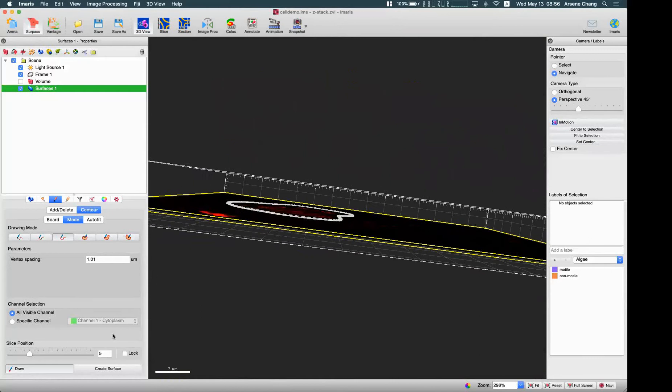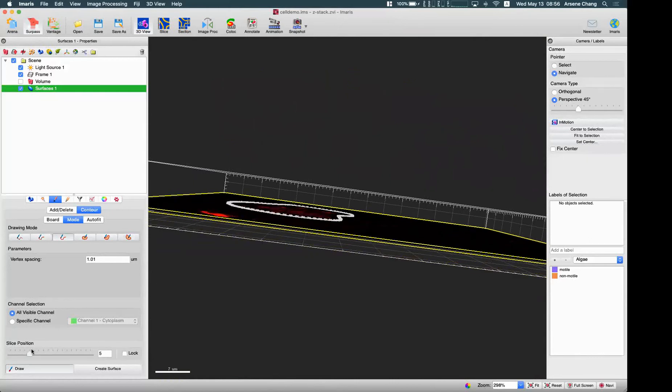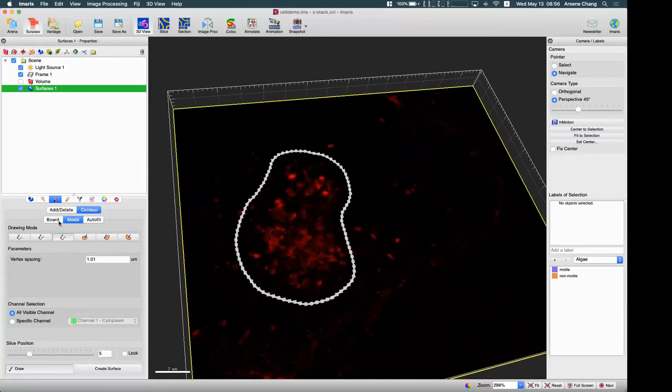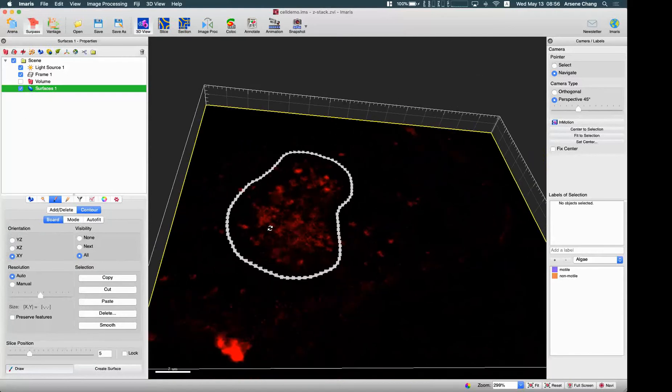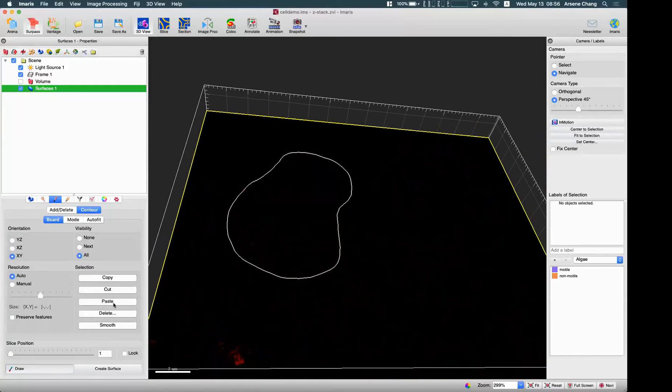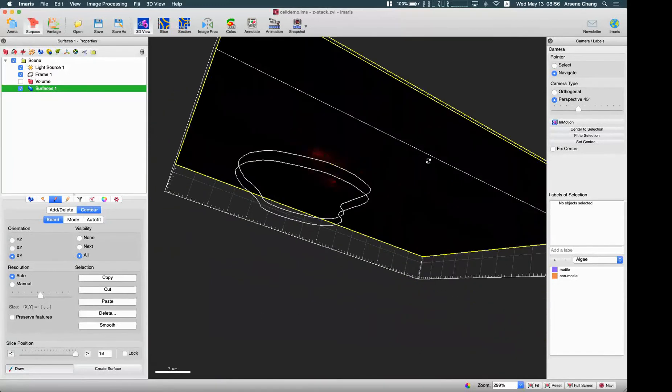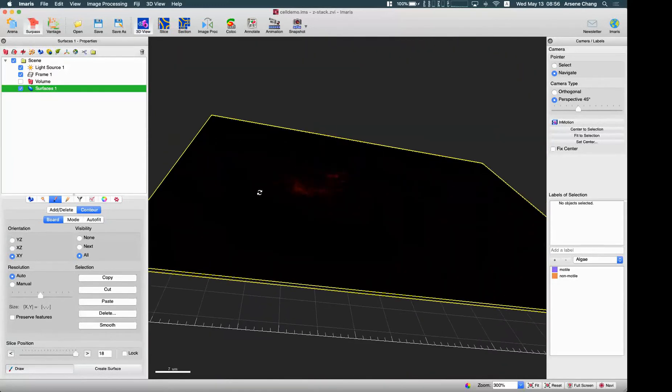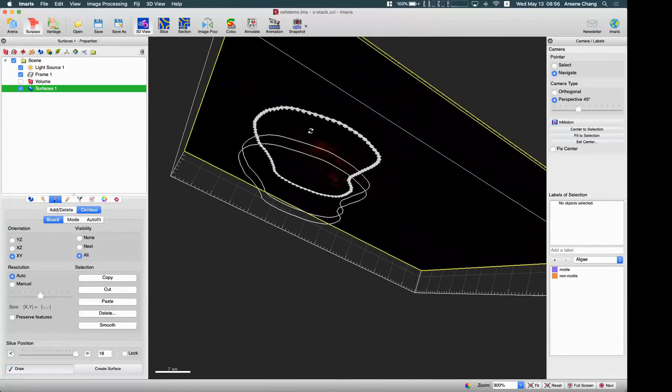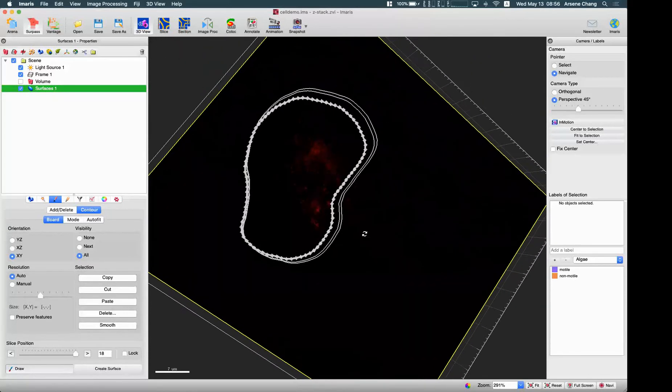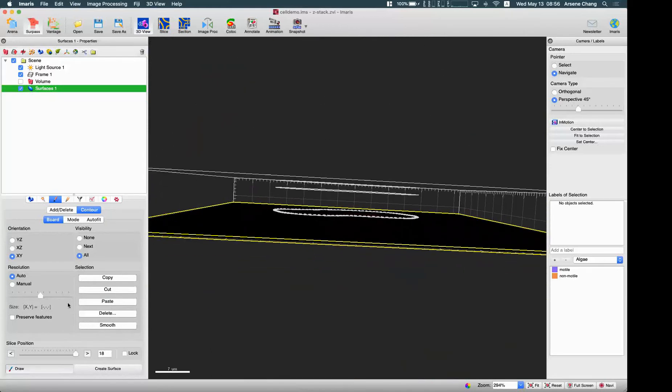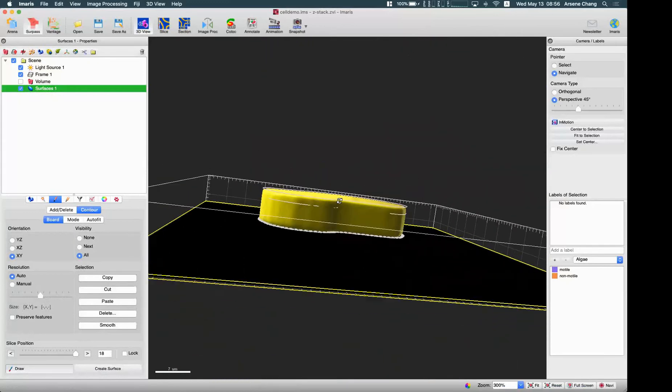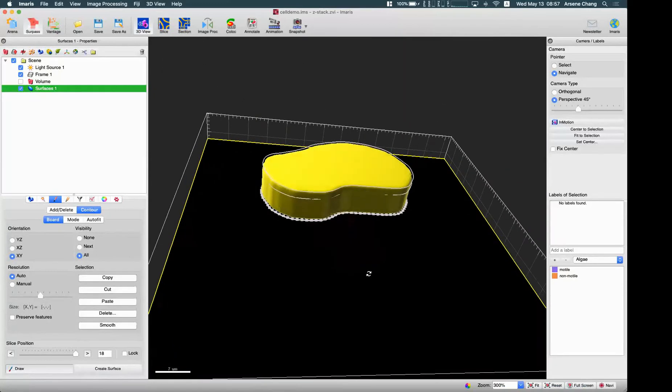All right, so let's say if this is the region of interest I want to use, I want to copy this contour and move to one end of this Z slice and paste. So I have another same shape, same contour and move it to another end of the Z stack then paste again. So I have three contours in 3D space. So after you make this contour, you can click on the create surface to create this surface as a region of interest like this.